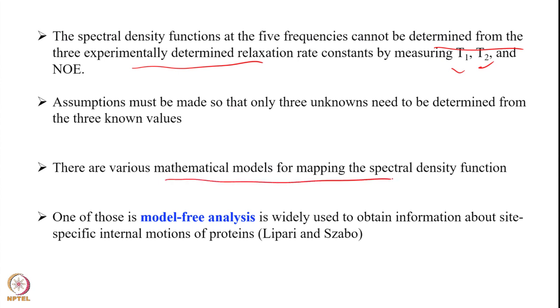There are various mathematical models that map the spectral density function, and one of them is model free analysis, widely known as Lipari-Szabo model free analysis, which gives the site specific internal motion of the protein. Towards the end of this week, we are going to briefly touch upon model free analysis, but essentially it can be determined from these relaxation rates by making some assumptions. Today I am going to give you a glimpse of what experiments are done for measurement of relaxation parameters.